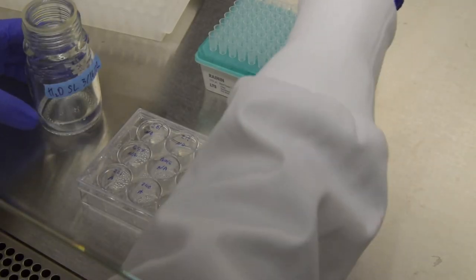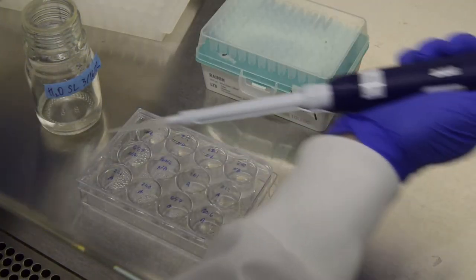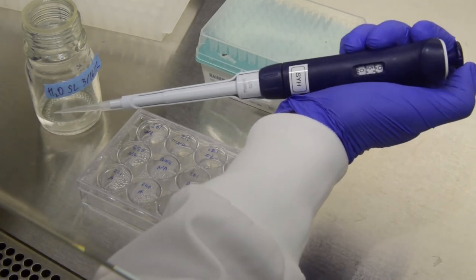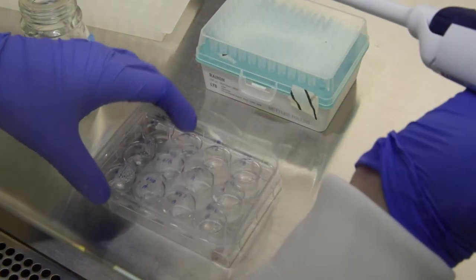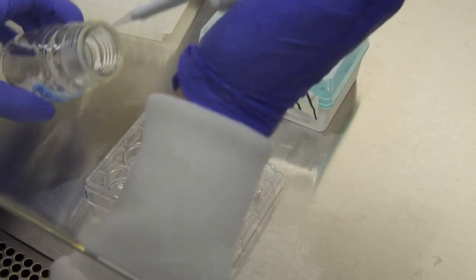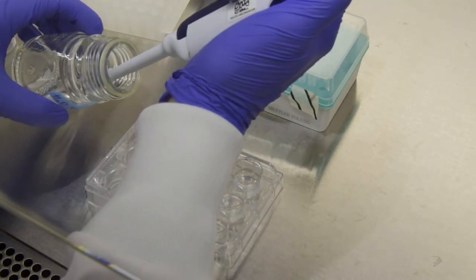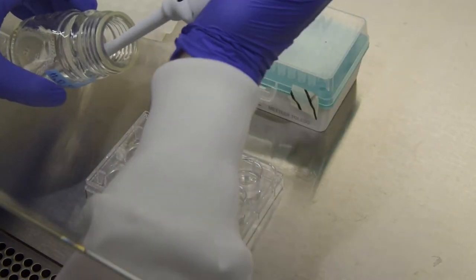Now it's time to set up the co-cultures. I first add water to any wells needed as a no agrobacterium control. I used 50 microliters of each liquid or suspension for these steps. I will then add the agrobacterium followed by the yeast.